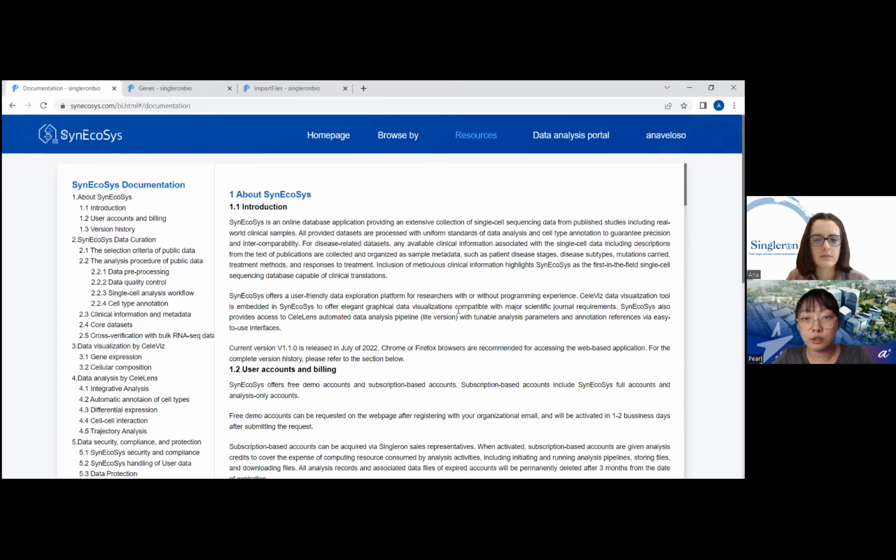Okay, over here I see the last question from Yi Tian. Is it possible to analyze TCR or BCR abundance and diversity? So we already have some data sets, but this is something that is coming with the next upgrade of the software that's coming later this year as well.